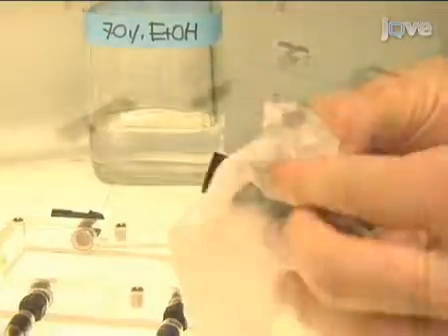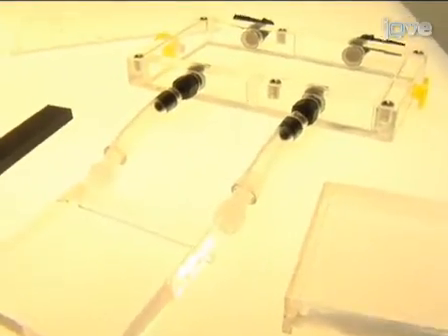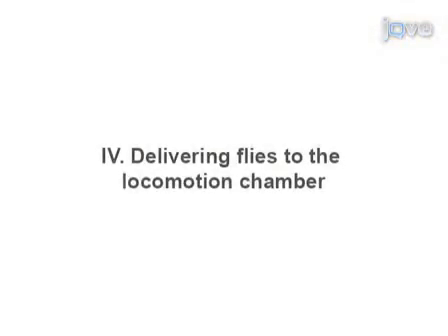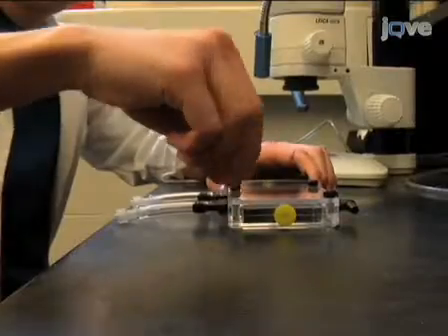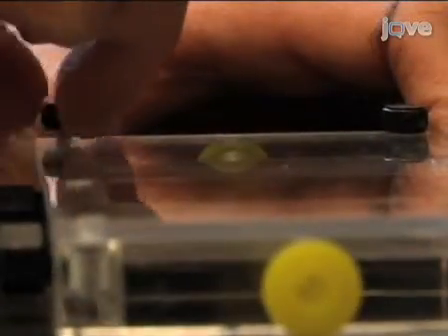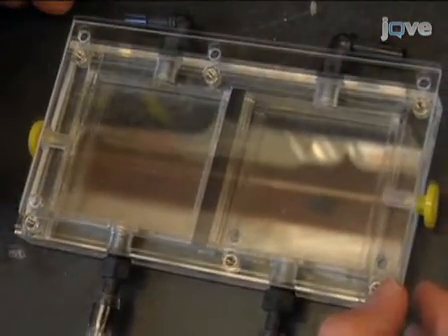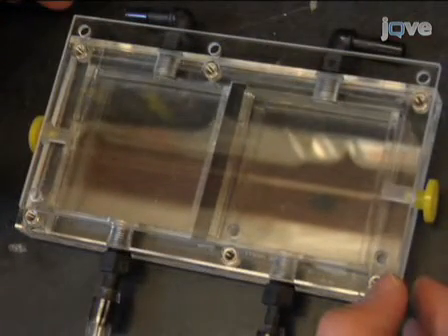Now that the tracking system is ready, we can deliver the flies to the locomotion chamber. To deliver the flies into the chamber, remove the screws which normally keep the small plexiglass top of the chamber secure. Then position the plexiglass top so that the screw hole sits directly over the inner chamber.